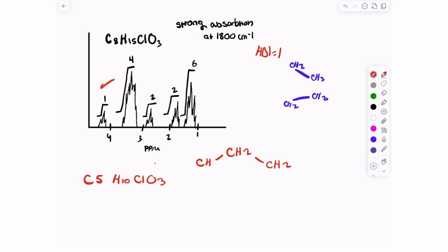So the next thing that I'm going to say is this CH has to be attached to 2 other atoms that don't bear any protons. So what could that be? Well, we do have some oxygens, and oxygens don't have to bear protons. There could be alcohols, but that wouldn't be a thing. You don't ever see something looking like that. So I think that's going to be our next step. Let me just write it like this so it looks a bit cleaner.